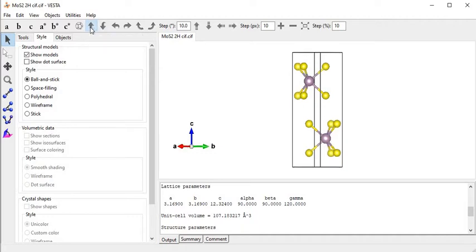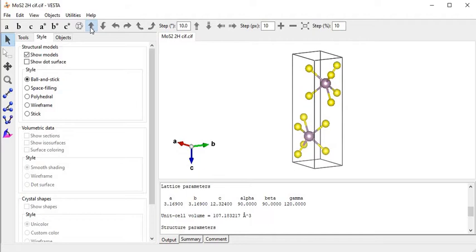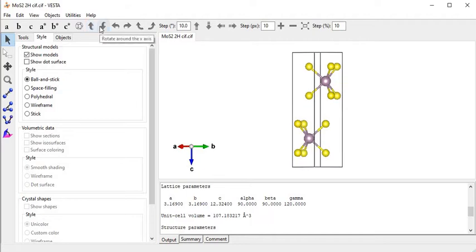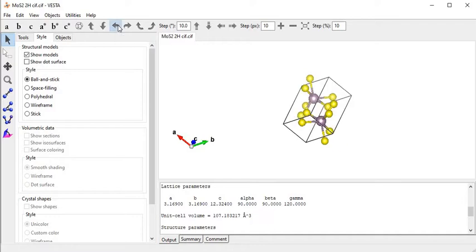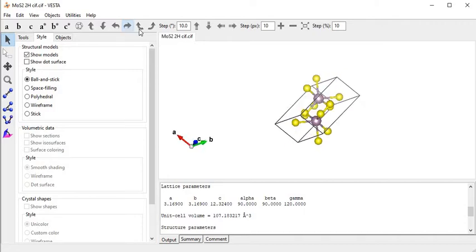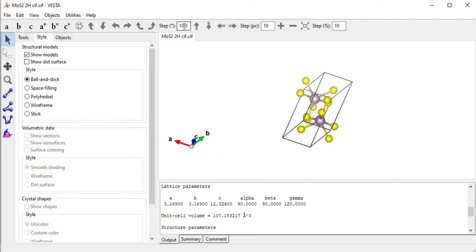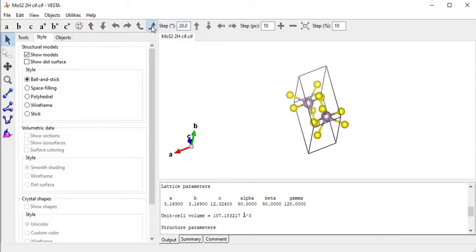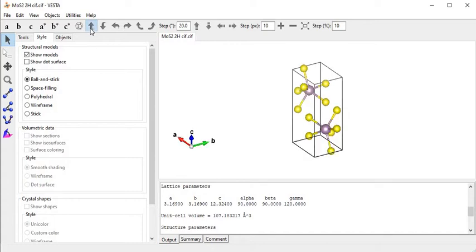I am going to rotate along the X-axis. As we click on that part, the axis is rotating along the X-axis, now in the opposite clockwise direction. We can also move along the Y-axis, and again along Y. This is around the Z-axis and also around Z. This is a step mode - for each click it moves by that value. For a single click it moves 20 degrees.